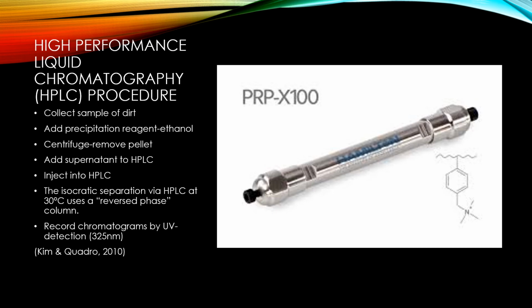The next test we ran was high performance liquid chromatography, or the HPLC procedure. First, we collected the samples of dirt. This test was not actually run by us because of other issues, so I had to look up procedures for how this would be run. So this is the one I found from the paper and that I quoted below.